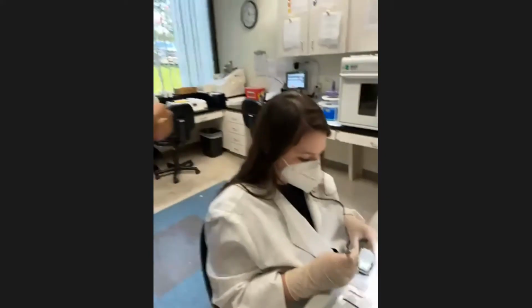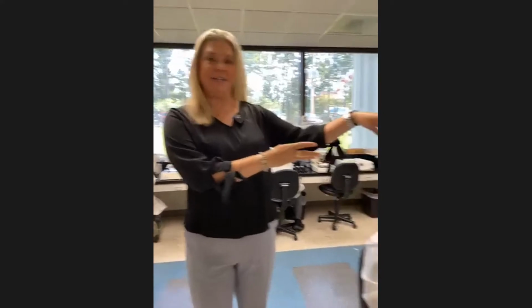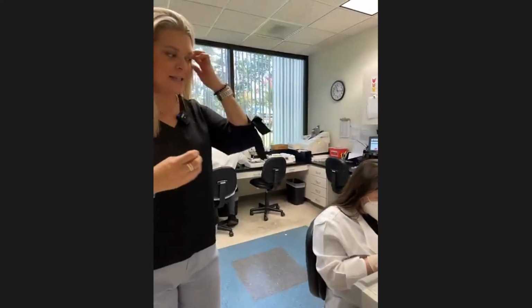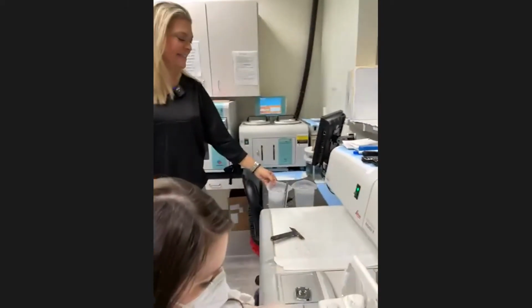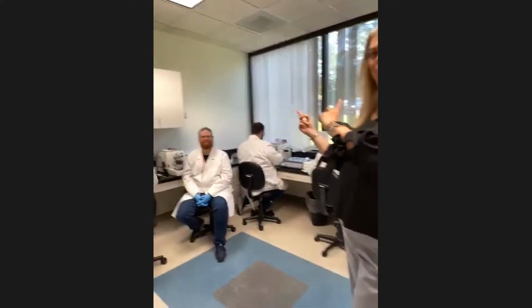Awesome. So like Kaylee said, she's filling that. Paraffin wax is what we use to embed the tissue in. So we put it in this mold and we fill it with paraffin wax, and we have a cold plate over here on the side that lets that paraffin harden up. It just sits in this cassette full of paraffin wax, and we put it in a little ice bath over here to keep it nice and cold and nice and firm to make the cutting easier. So after we get that paraffin firmed up, we are ready to go over to the cutting area.